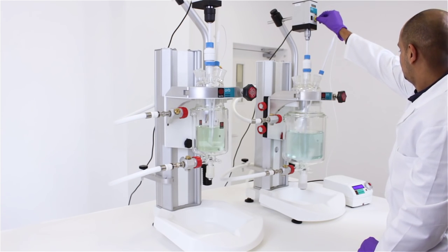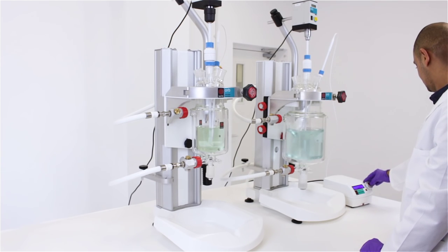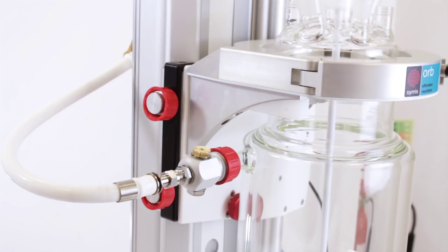The compact design saves space and its robust, durable construction ensures longevity and reliability. Orb has been built to the highest quality, with clever usability features at the heart of its design.